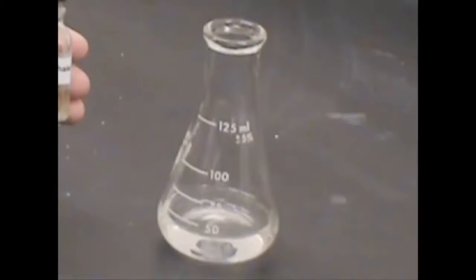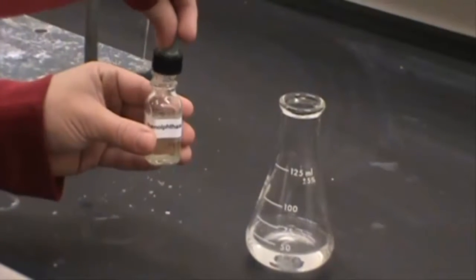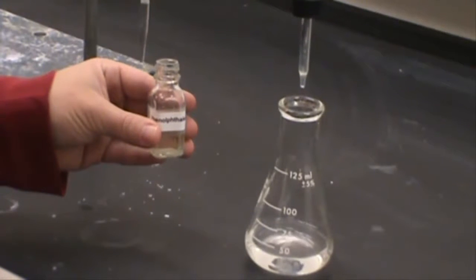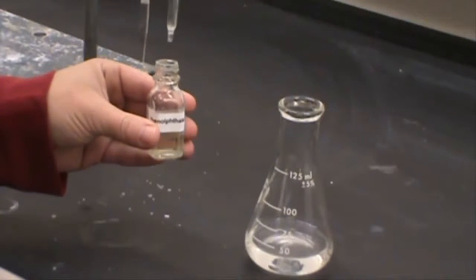You'll be dispensing the acid into a new piece of glassware called an Erlenmeyer flask, or simply a flask. In order to know when the pH reaches a certain level, a pH indicator is added to the acid in the flask. We will be using phenolphthalein.